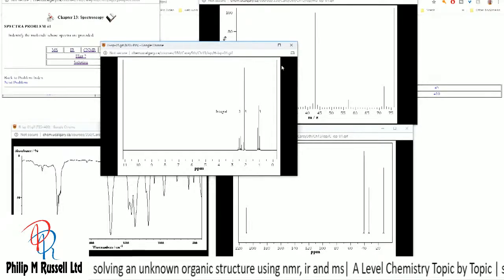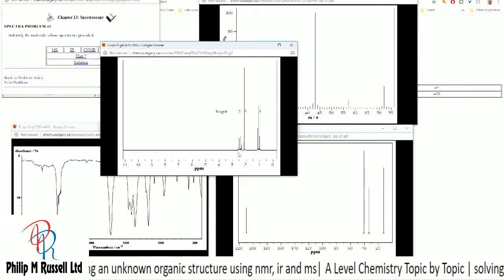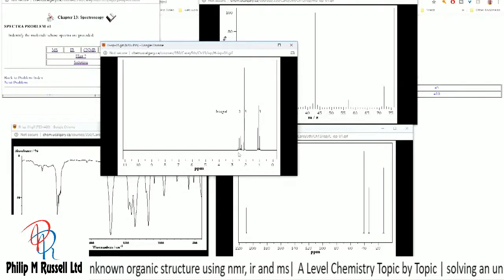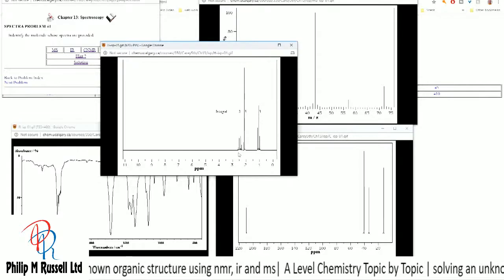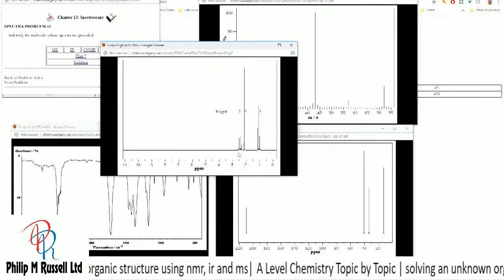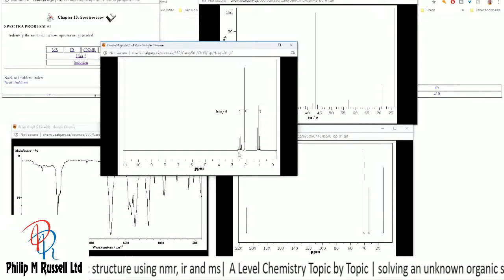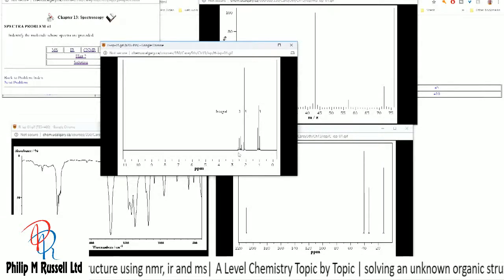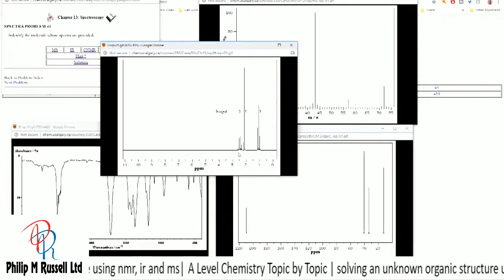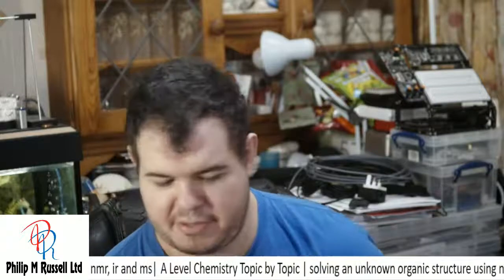And then finally you've got this next one, which looks like a quartet. It's 4, so using the n+1 rule, n+1 equals 4, so n equals 3. So that means it's a proton group that's coupled to 3 protons of a CH3. So that's coupled across, the two are coupled together, because that makes sense.